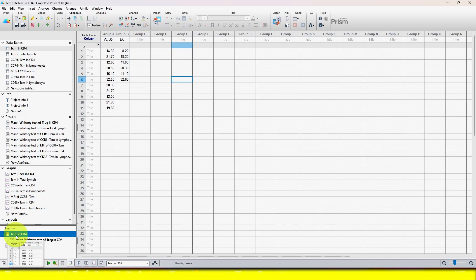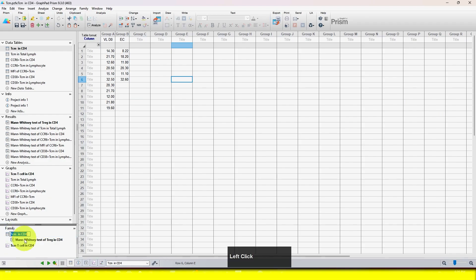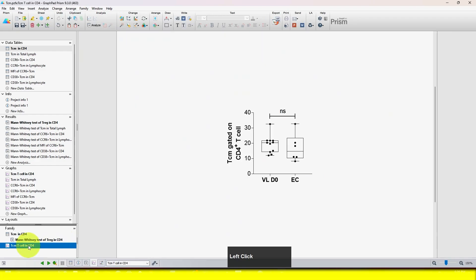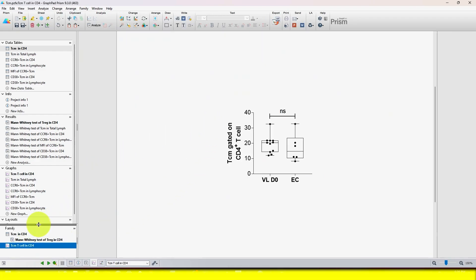Just go to the Family section and select what you want to see. For the data file, click on data; for the result, click on the result file; and for the graph, click on graph. So this is very easy. If you are not using this section, try to use it and you will save a lot of time.